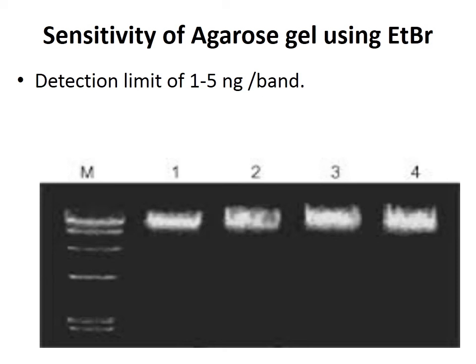So when we compare the fluorescence intensity of an unknown band of DNA with the standards, we can estimate how much fluorescence the unknown band of DNA is producing. And then by matching the fluorescence intensity with the standards, we can estimate how much DNA is present in that band of DNA. So these are the two important parameters which we can deduce from agarose gel electrophoresis. That is, we can determine the molecular mass as well as estimate the concentration of DNA present in that band.